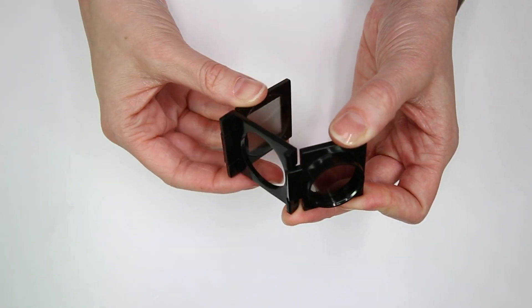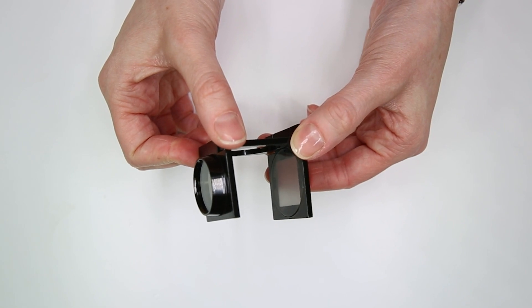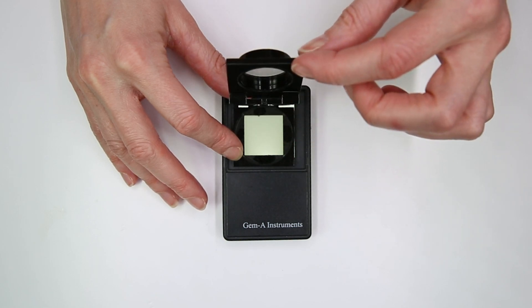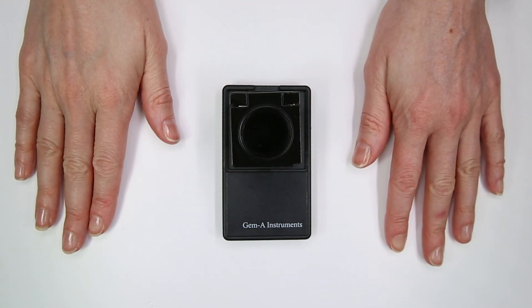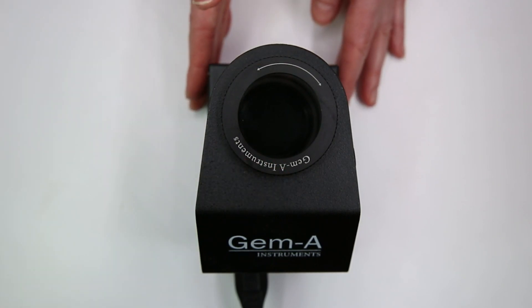To use the portable polariscope, open it fully by moving the two filters back on themselves to lock it into place. Put the polariscope on your light source and turn the light source on. The test results will be most easily seen in an area without surrounding light. When looking through the polariscope the bottom stage will appear dark, indicating the polarizing filters are at 90 degrees to one another, also known as the crossed position. With a bench polariscope, turn the top filter until the bottom stage appears its darkest.